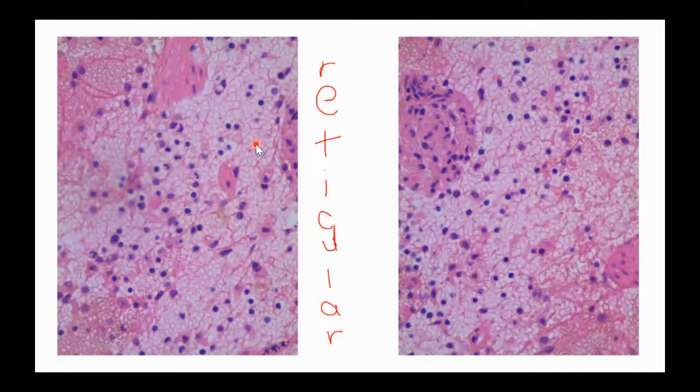The nets catch the bad stuff. The white blood cells that we see go through and eat it up. They do a process called phagocytosis. They eat it. So these are my two best pictures of what reticular connective tissue looks like. You can see those little nets that help us to catch stuff. Reticular connective tissue.